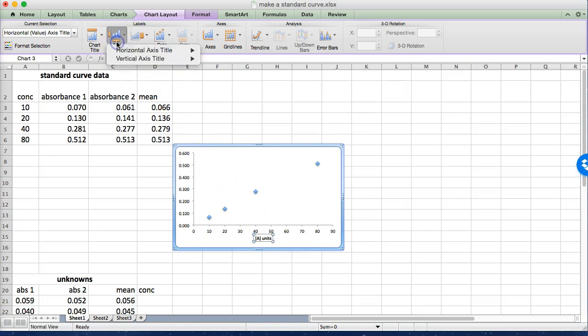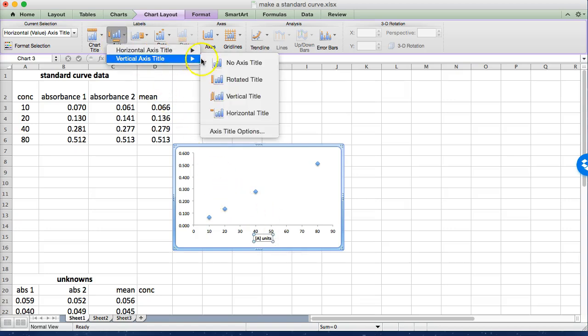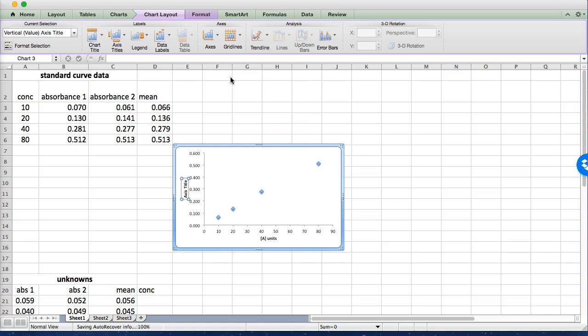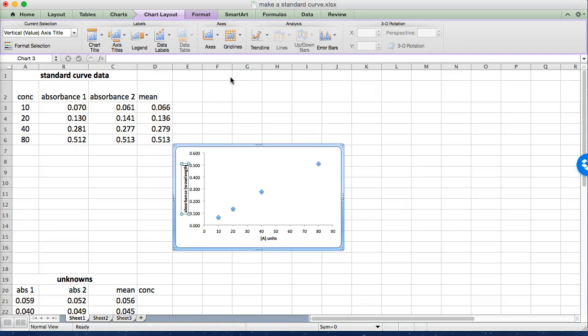And then we also need a vertical axis. I like to rotate them this way. This is going to be your absorbance and generally you would put your wavelength so that it's obvious how those were measured.